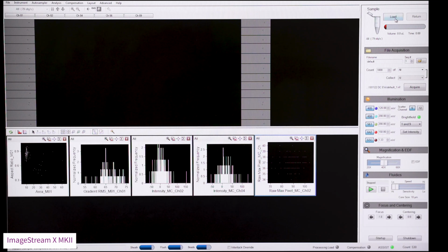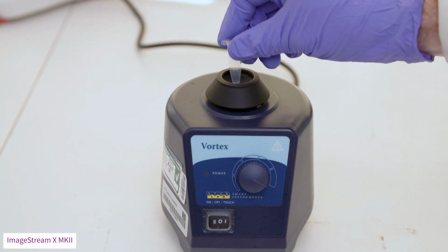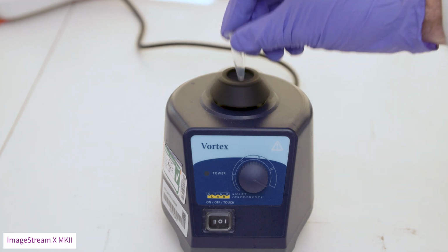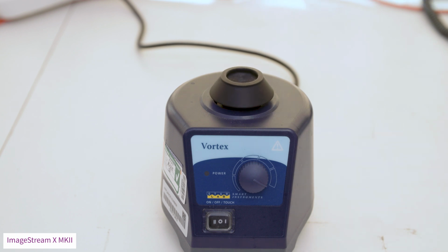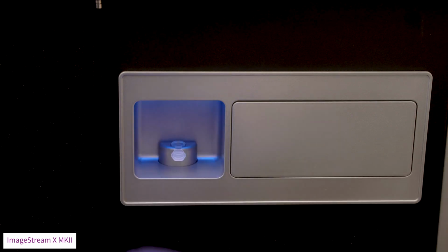To begin, press Load. Thoroughly vortex your sample. Your sample should be as concentrated as possible and ideally be 30 to 50 microliters and have absolutely no bubbles. Insert your tube with the lid facing towards you.